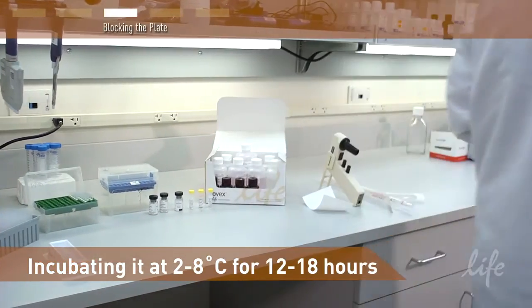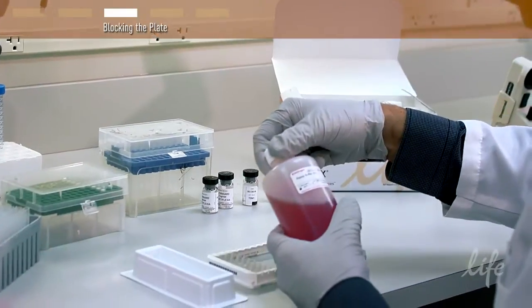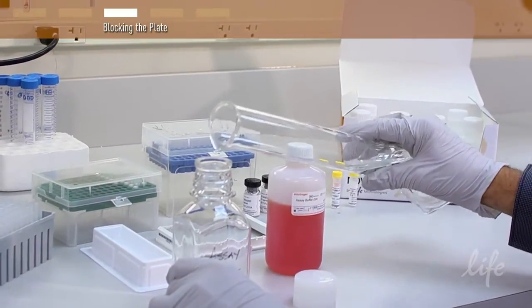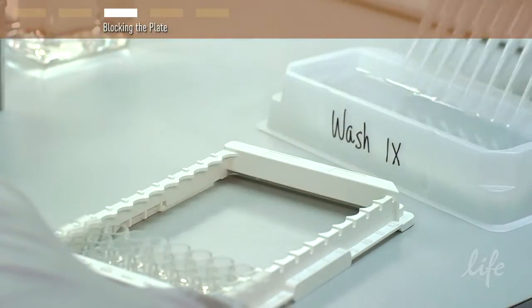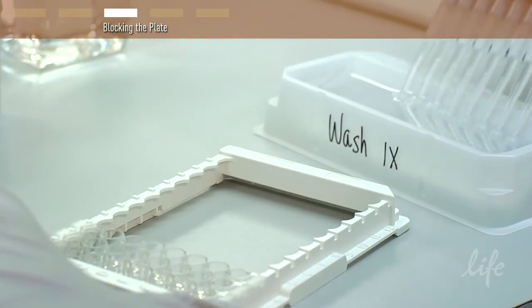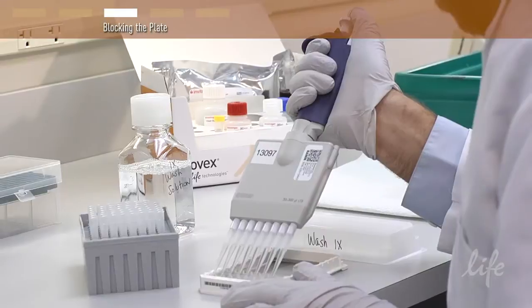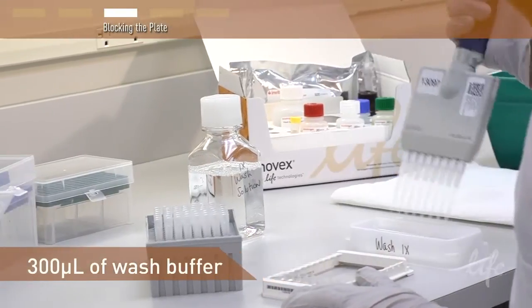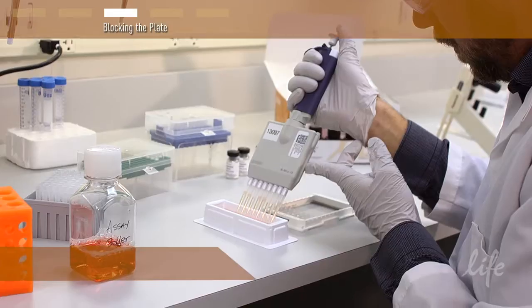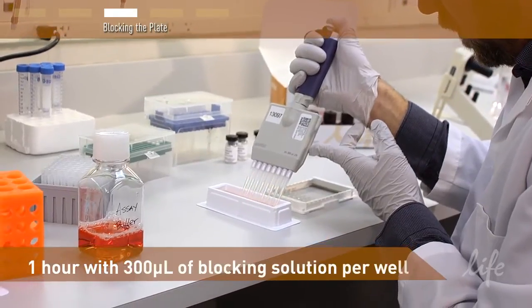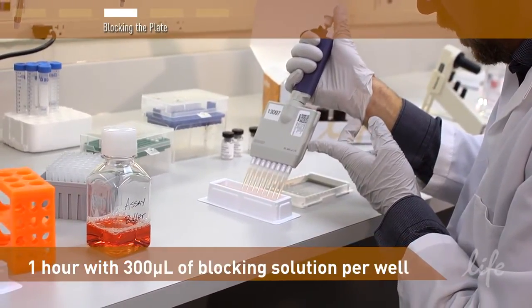Next, prepare wash and blocking buffers. Dilute the concentrated buffers with water as indicated in the protocol. Remove the antibody solution and wash the plate either manually by decanting into a basin or with an automated plate washer. Fill each well with 300 microliters of wash buffer and then decant. Remove the wash buffer and block the plate for one hour with 300 microliters of blocking solution per well.